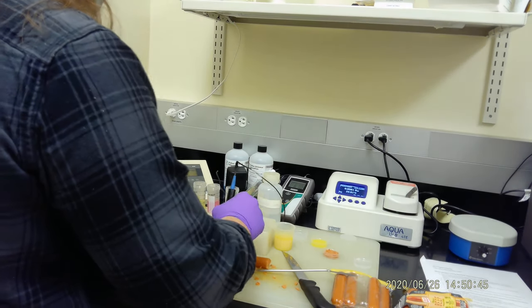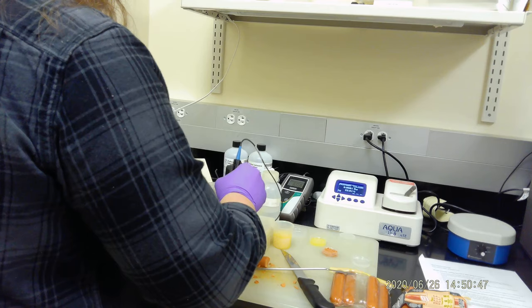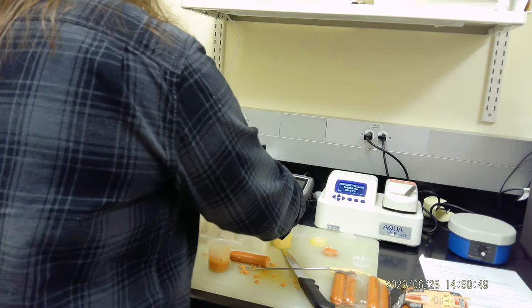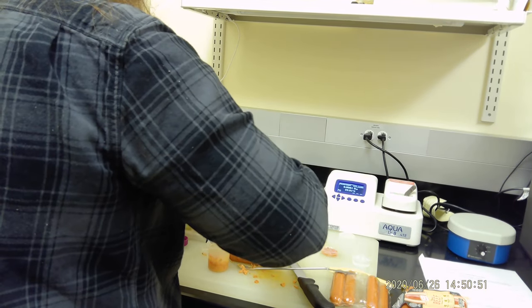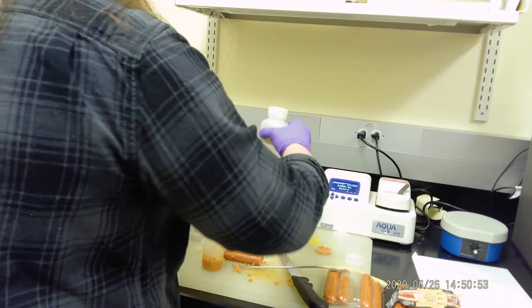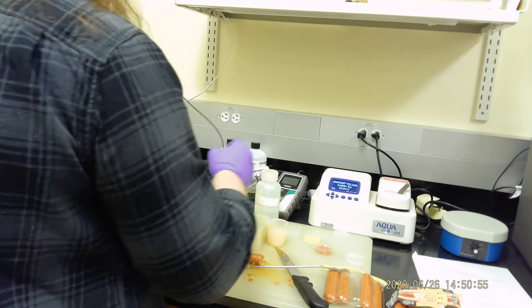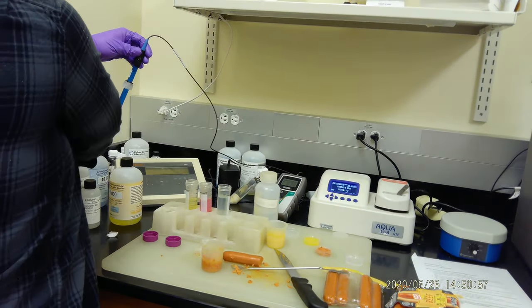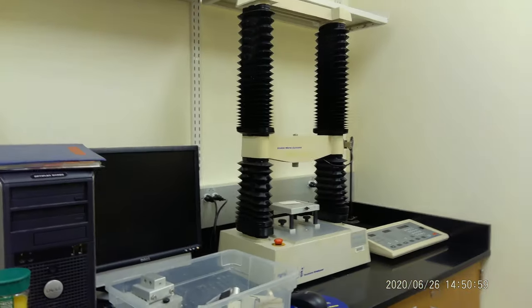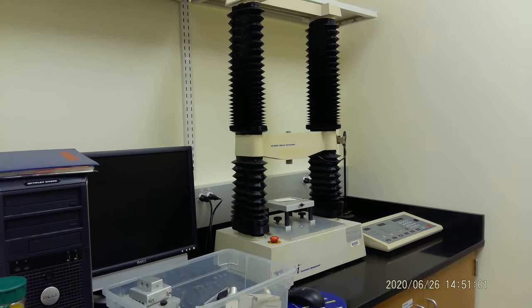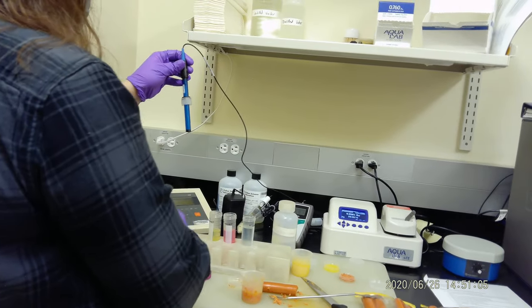So that's pretty much all I have today. We showed you water activity and pH—you're going to use them all the time. That's the end of our first lab practice. Then we have time. Next time we will do the texture analyzer, right there. One more thing is the moisture meter.